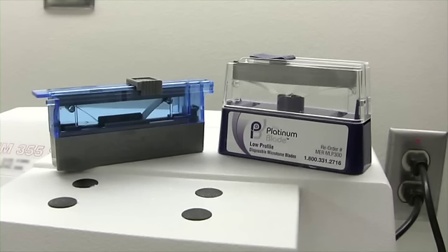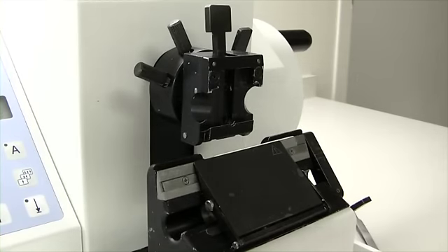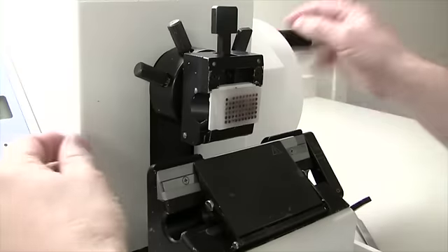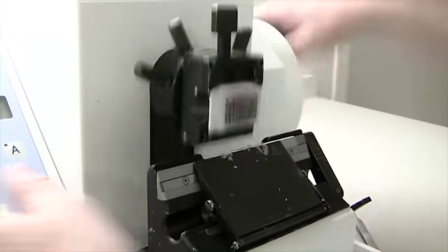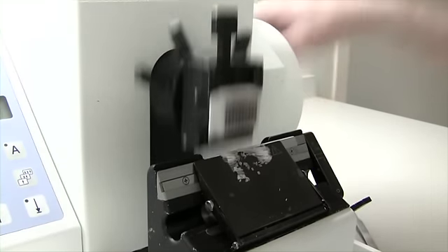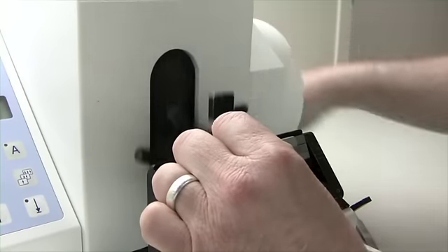I'm not going to cover cutting procedures because there are as many techniques as there are histologists. First, trim into your array block so the surface is flat. If your microtome chuck is at a different angle than your array block, you may want to adjust the chuck so it's flat against the block. You don't want to cut away valuable tissues facing into your array block.